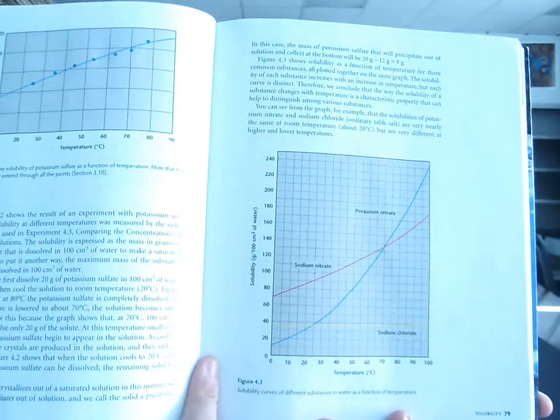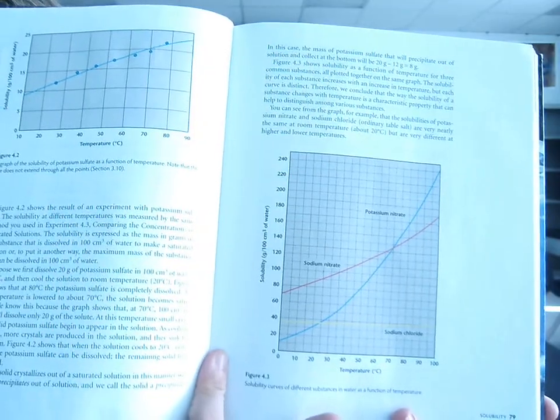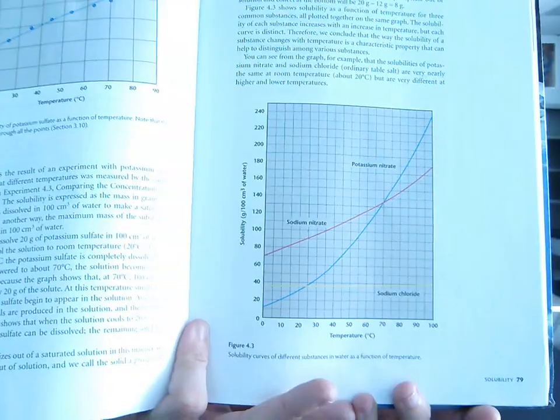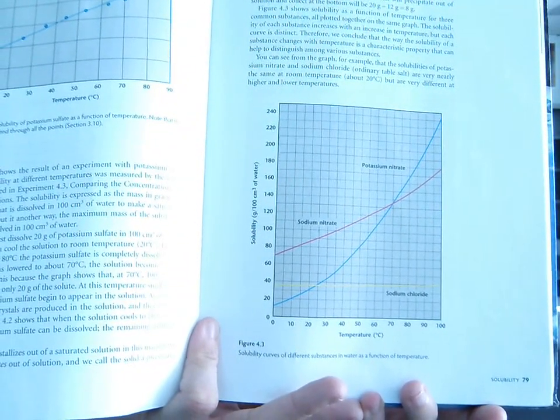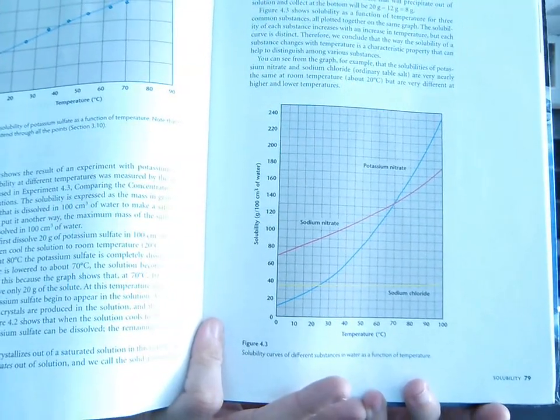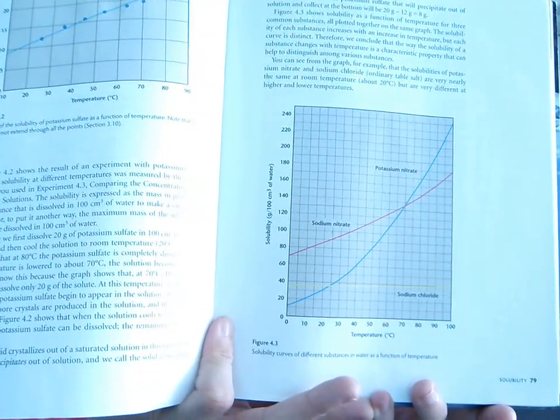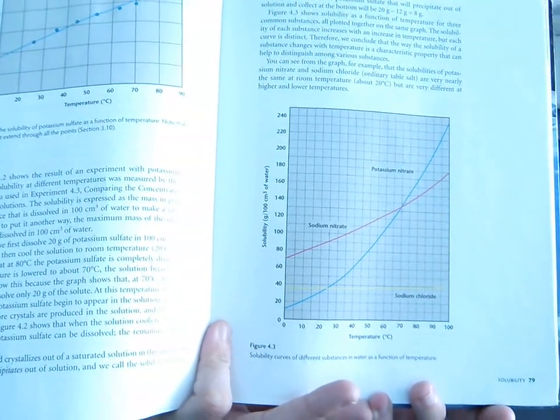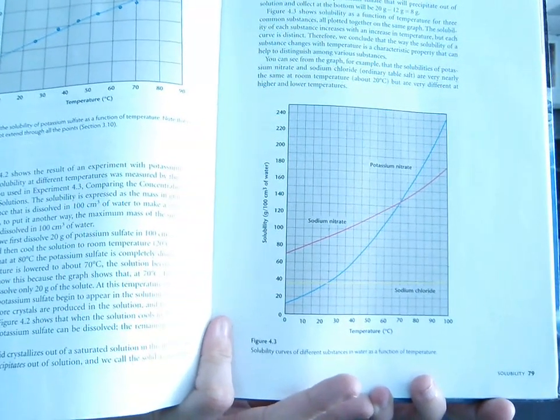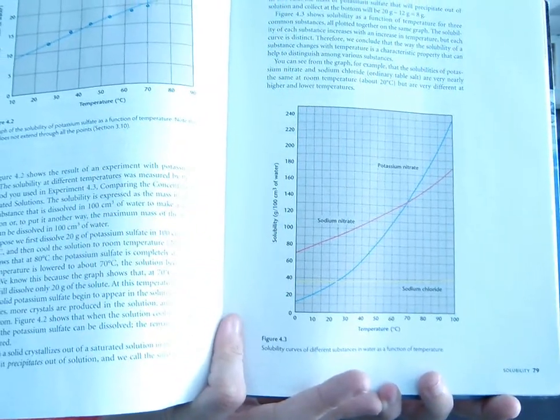So if you look at the yellow line that says sodium chloride, that was actually our substance A. You might want to look at your own book, but you can see that the solubility of sodium chloride in water doesn't really change all that much when you heat it. It does go up ever so slightly, but in terms of just the observations we can make by looking at it, it does not appear to be any more soluble at a higher temperature. Although, if you look at the graph, it is a slight bit more soluble at a higher temperature.